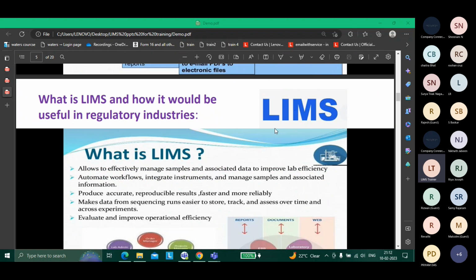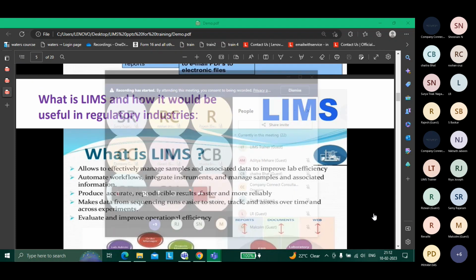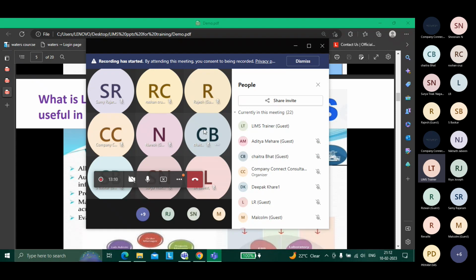So what is LIMS in general? I am not talking about LabLIMS, StarLIMS, Sample Manager, or any other thing. We all know the full form of LIMS. If I ask someone what is LIMS, many people will say, okay, we can do stability management, we work on the EM module, we work with lots, we track this sample, we integrate it with SAP, we integrate it with Empower, we do this in the lab. But making it very short, what is LIMS?